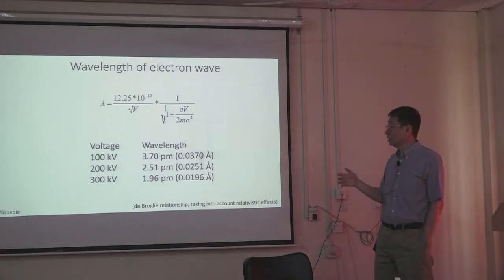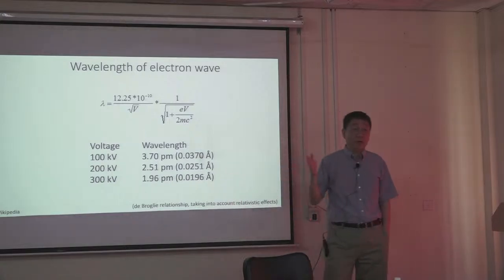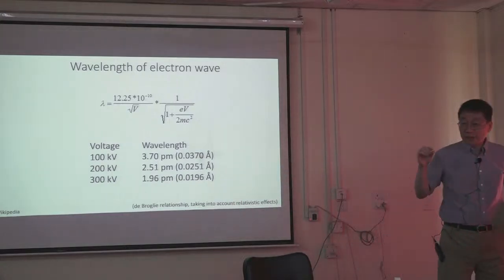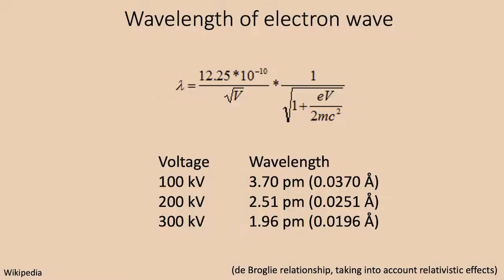Okay, so certainly you can see very detailed information, but electrons are very light, so there are limitations on how thick a sample you can use. X-rays are penetrating, they go through almost anything. Electrons are very light, so you have to have very thin samples. Anything that gets thicker, you see black. The electron cannot go through. You don't see it. So that's one of the limitations.